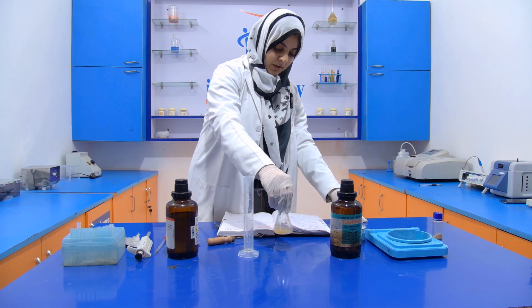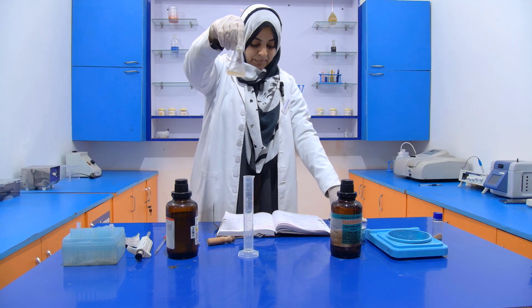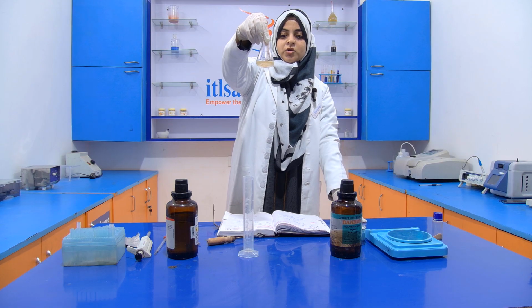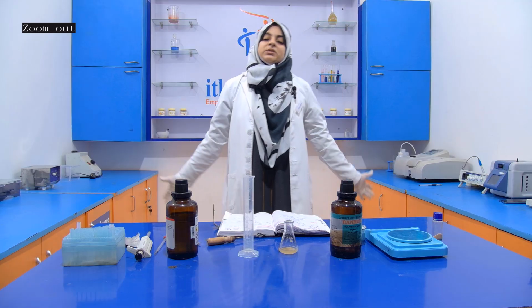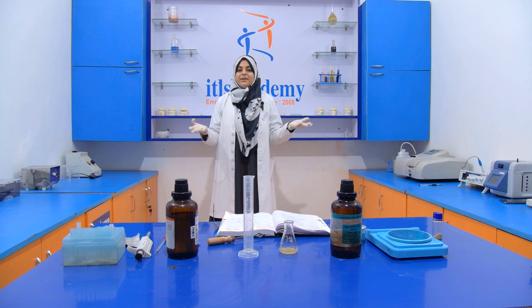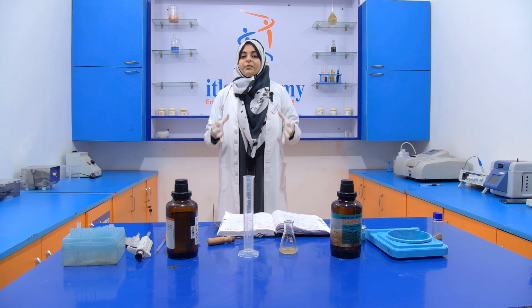If the colophony residue is present, then this solution turns a bright purplish red color, and it rapidly changes into violet. But here you see that there is no color development, which means that our sample does not contain any colophony residue. Which means that our sample is pure. So this is all about today's experiment.